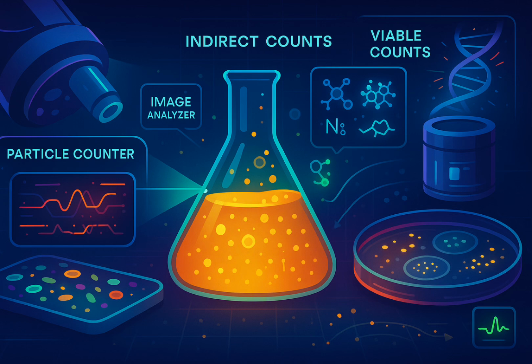So what are the key things someone needs to think about when choosing? Number one, purpose. Total count, viable count, active count. Do you need high sensitivity for low numbers? What's the goal? Then practicability. What's your sample like? Is it clear or cloudy, colored, does it have particles? How does the microbe grow: single cells, clumps, filaments, spores? What kind of microbe is it, easy to culture, how big? Then resources. What equipment do you actually have? How much time, how much labor, what budget? Makes sense.